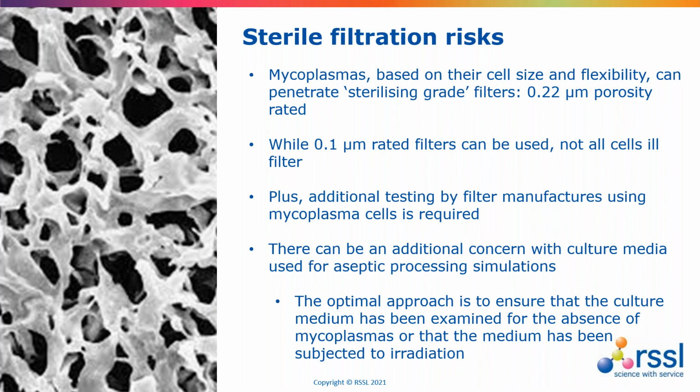And from a GMP perspective, that would then require demonstrating by the filter manufacturer, and this would be an additional test requested aside from the standard test of sterile filter qualification. So the standard sterile filter qualification would probably be using a bacterium like Brevundimonas diminuta. For mycoplasma clearance, additional testing and filter controls would be required.